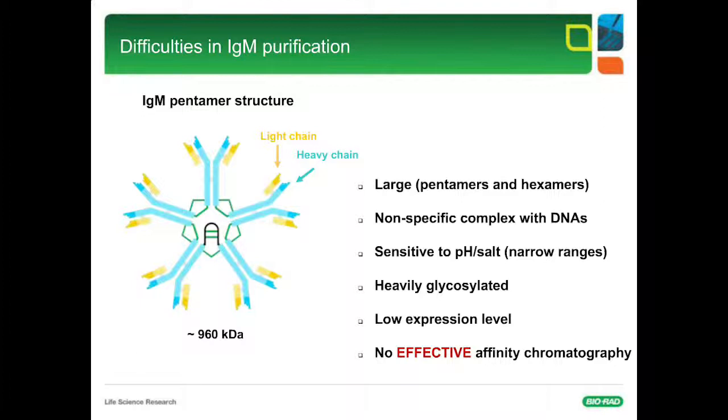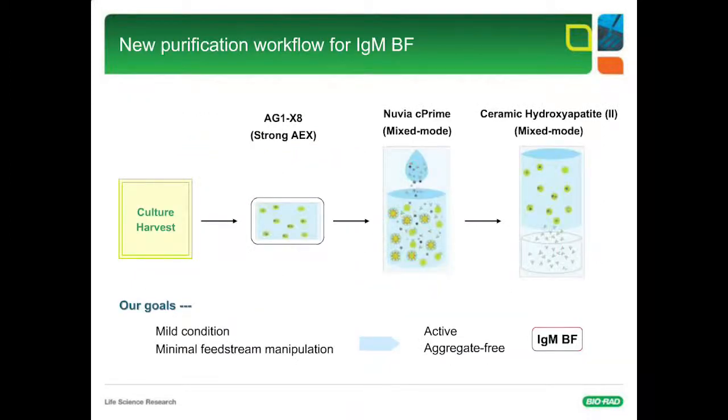And we can't really use protein A because IgM molecules are sensitive to low pH, and there is no other form of affinity purification currently for IgM molecules.